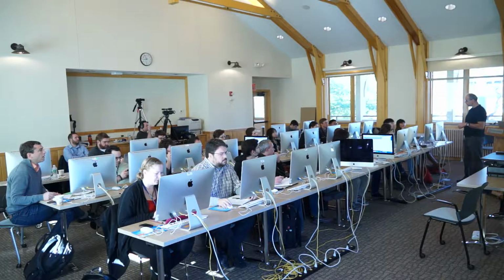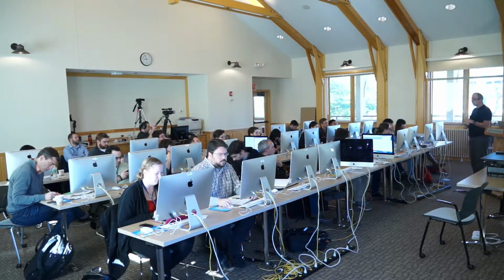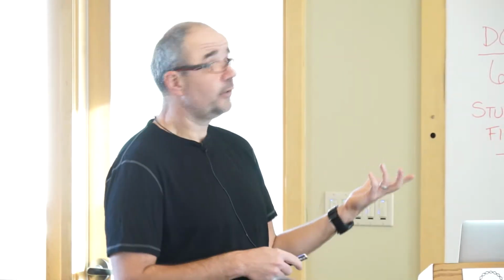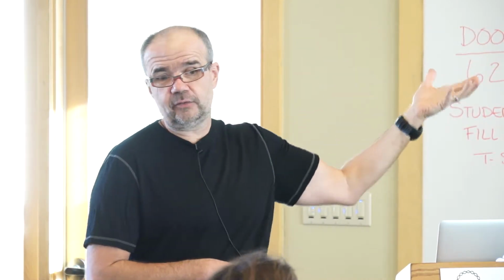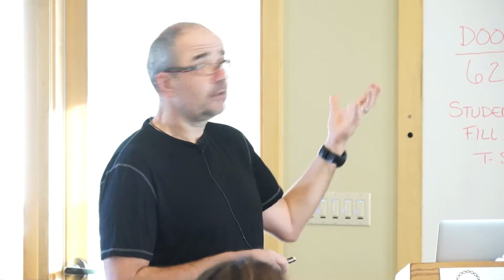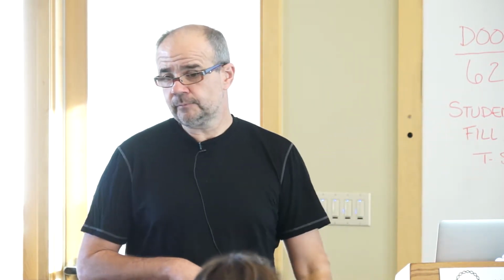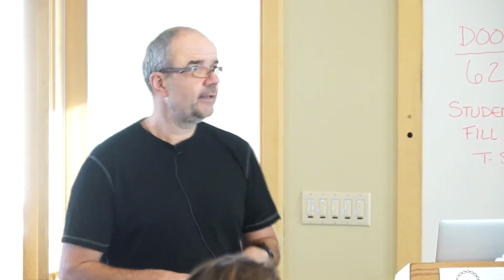So does this require you to spot that this might be a local misalignment, or is there a file that gives all the locations of potential misalignments? Well, I think again there are different approaches to how to detect it, basically counting misalignments in a region. There are ways to detect it automatically, or by eye, and certain types of aligners will deal with certain types of problems. Yeah, but there's not a one-size-fits-all solution to these.